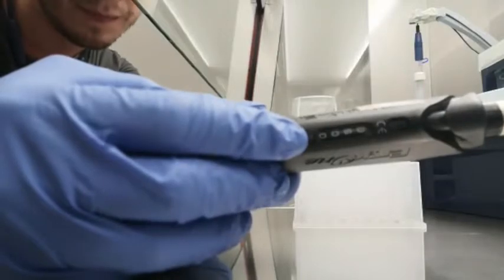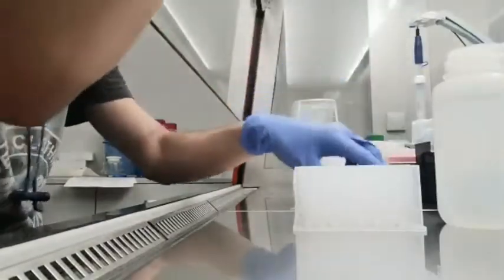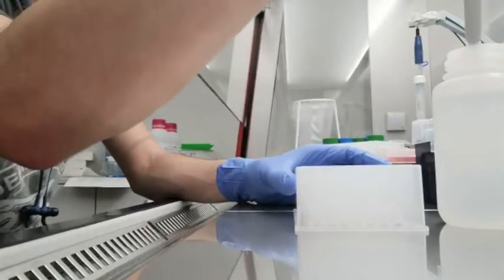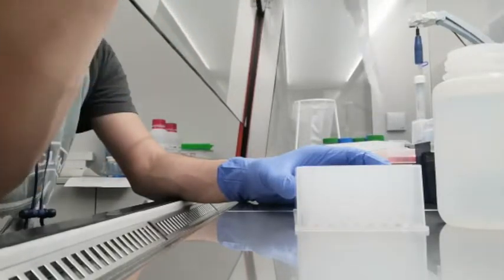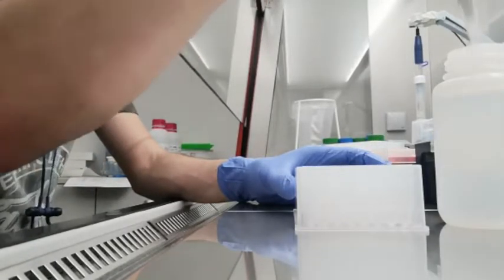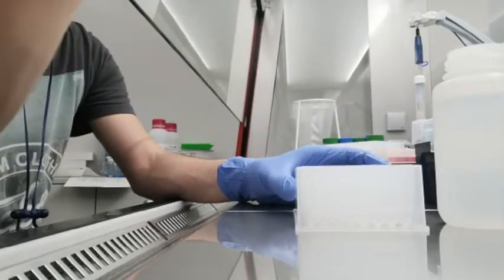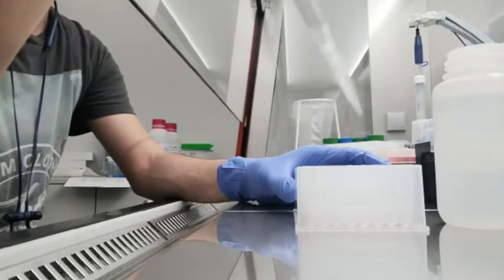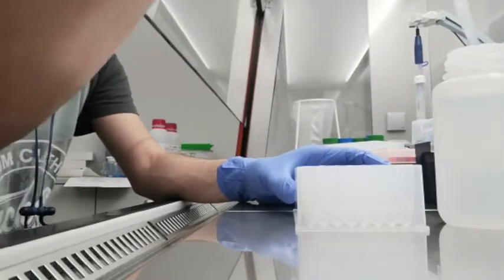Pipette 600 microliters of wash buffer and lysis buffer. Insert wash buffer in the first plate, the second plate, and the third plate. The plates are supposed to be deep well plates with 2 milliliters of volume. Once you have pipetted the number of samples that you are processing, meaning if you are processing 3 samples, you only pipette the 3 wells.